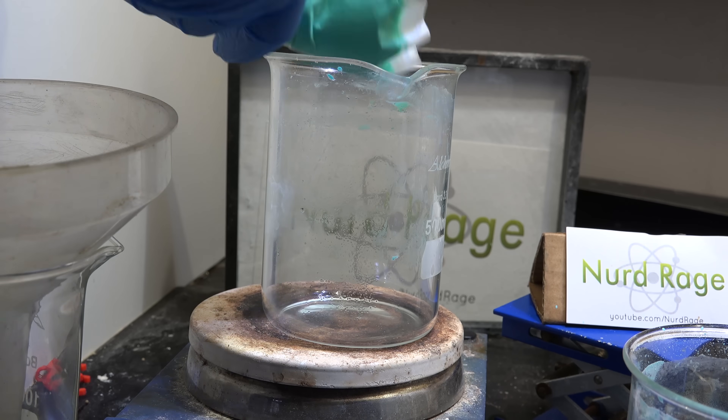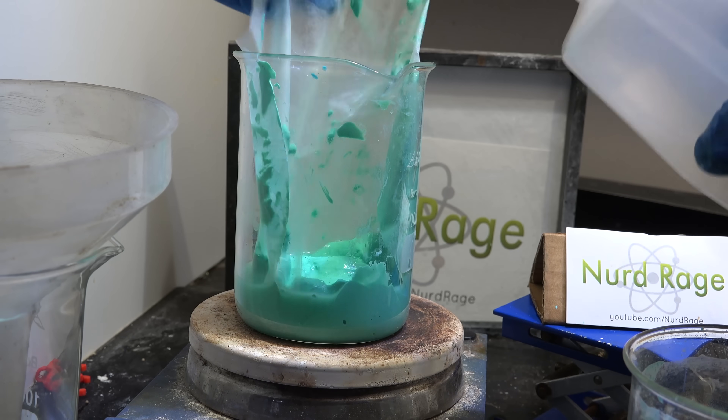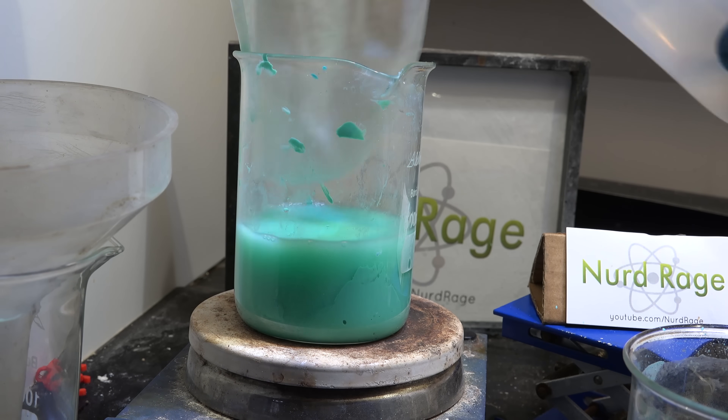We transfer the wet copper carbonate hydroxide paste over to another container and wash down the filter paper with some water for a total volume of about 200mL or so.